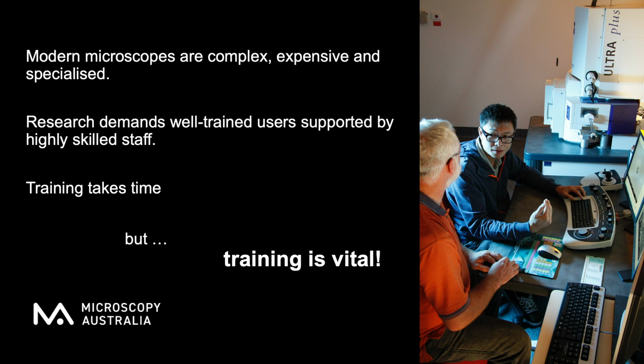So, as I'm sure you're aware, modern microscopes are complex, they're expensive, and they're specialized. And the research done by the researchers demands well-trained users to be supported by highly skilled staff. So, not only does that mean that the researchers can get the best out of their instruments, but it actually protects the instruments against misuse.